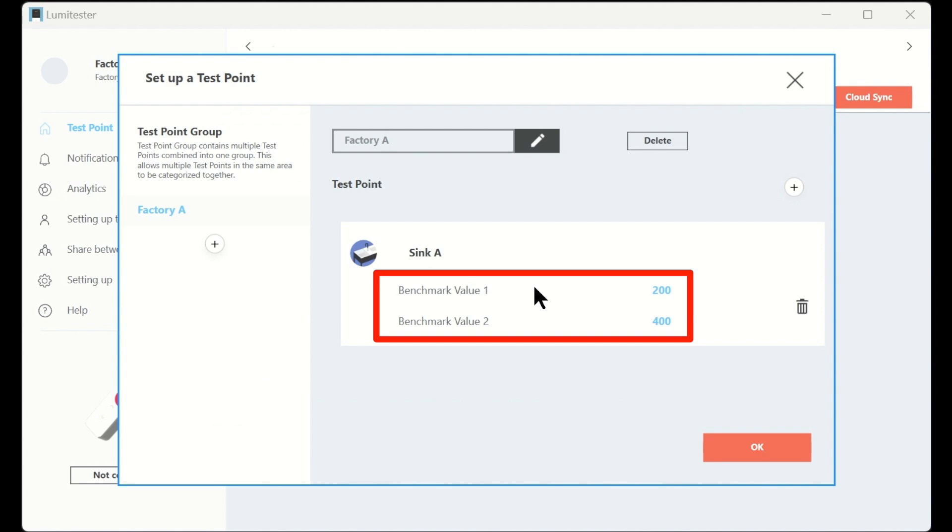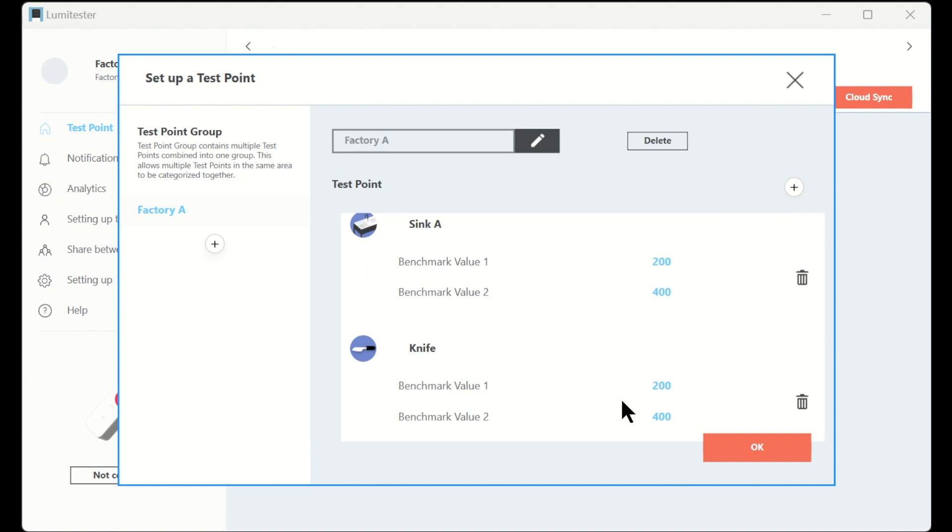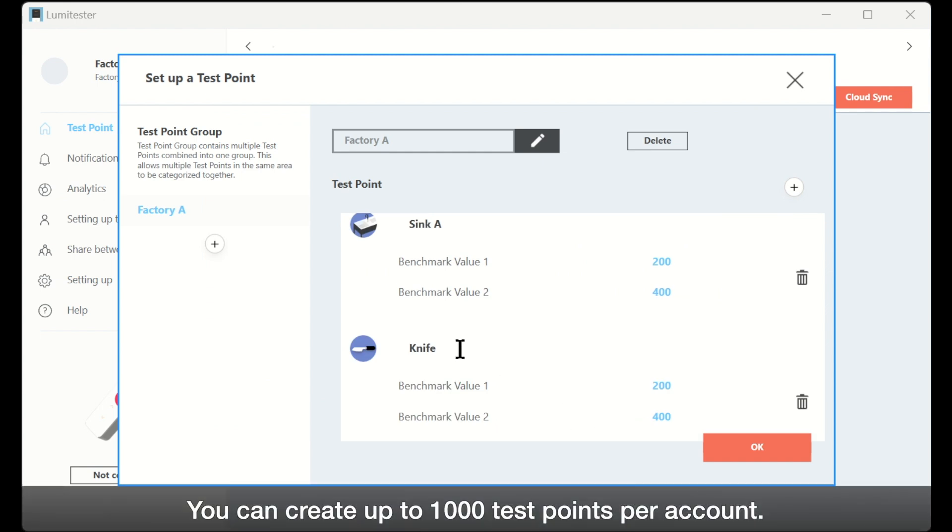Please repeat these steps until you have added all the test points you need. At last, click or tap the ok button to complete settings. Up to 1000 test points can be created per account.